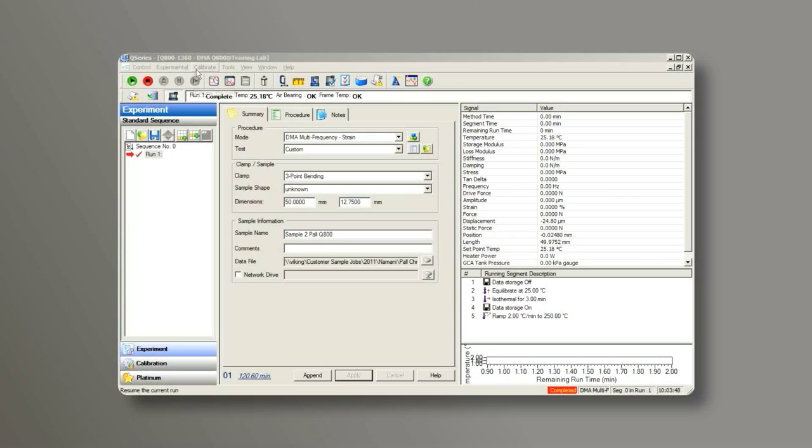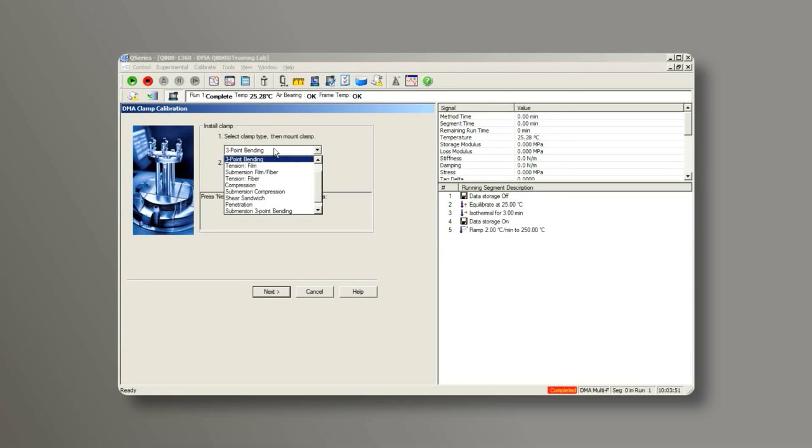From the control software, go to Calibrate, Clamp, choose Film Tension, All Calibrations, Next.